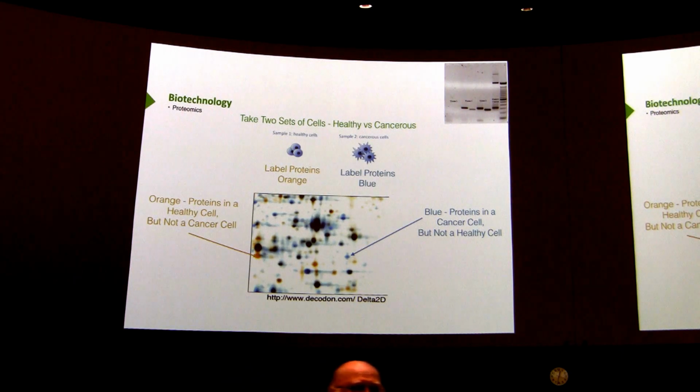So is it possible to see protein cleavage? Well, you're not going to see cleavage unless you use a cleaving reagent. SDS is not going to cleave anything. But let's say you treated your sample with a protease that chewed up proteins. You'd see a very different pattern here. Yeah, you bet. Once you've altered the protein, you are going to see a difference in mobility, both in terms of size and probably in pI as well.